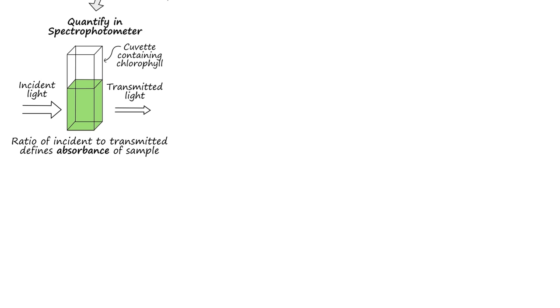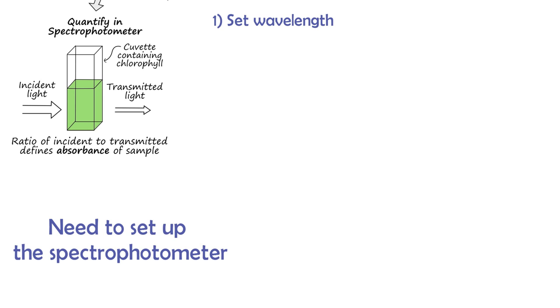The ratio of these measurements is used to define an absorbance value, which we'll read directly from the spectrophotometer. Before measuring the absorbance of the chlorophyll sample itself, we need to define zero on the spec and tell it which wavelength of light to measure at.